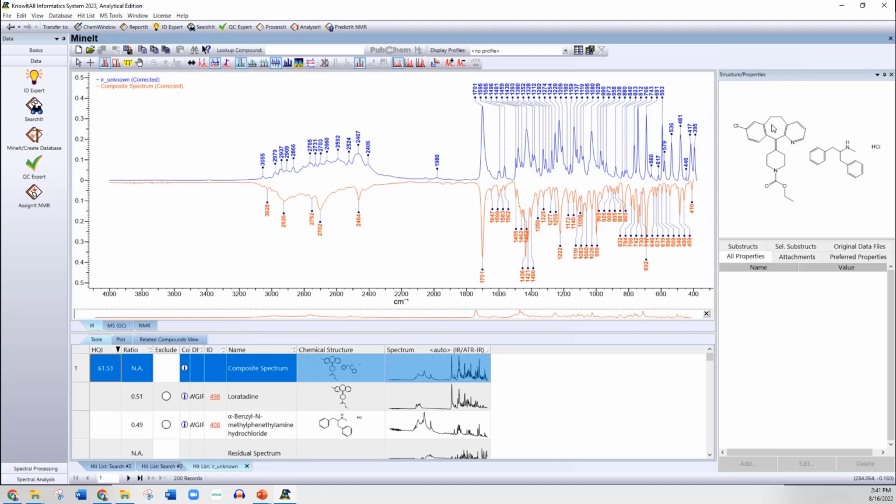We can see from the right-hand corner, it thinks that it probably has the carboethoxy group for the carbamate, which we thought we saw and is consistent with our mass spec data. But it also sees this hydrochloride salt. But of course, when you're doing infrared data, you're not really looking for exact structures in many cases. You're looking for features in the compounds present that would give you an idea of what your unknown might be. Well, it did find our carboethoxy, and it says it's a salt.